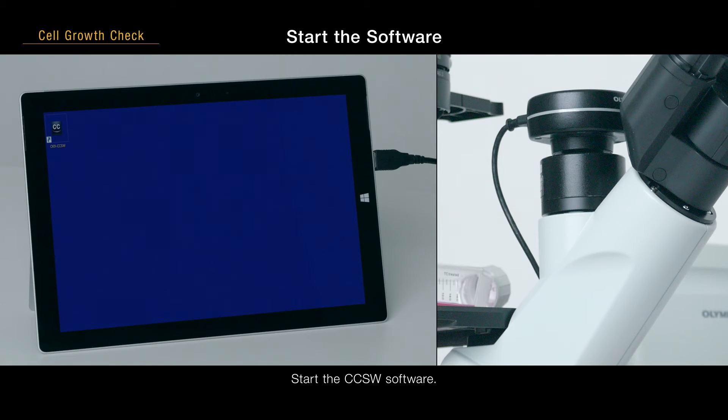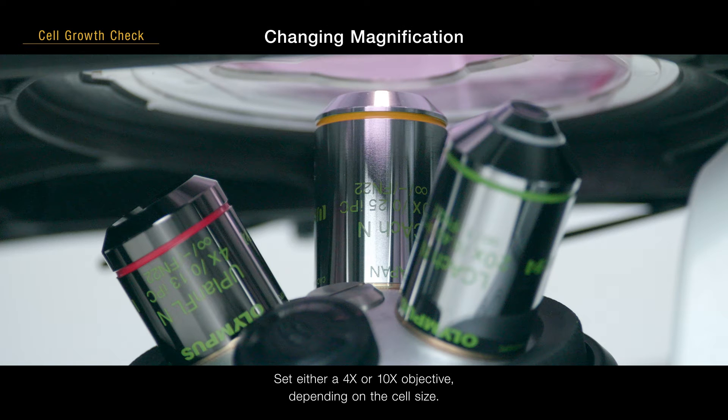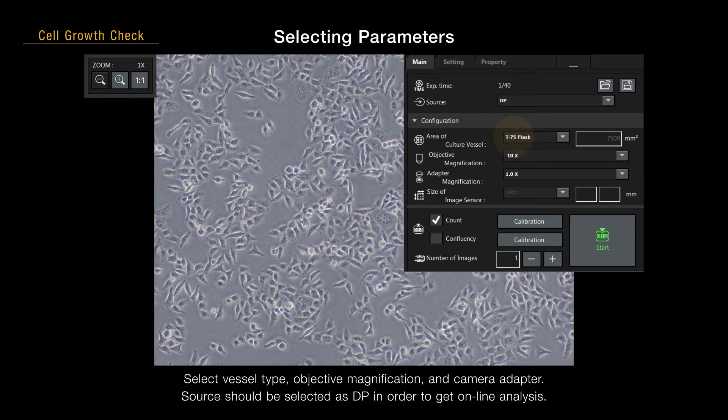Start the CCSW software. Set either a 4x or 10x objective, depending on the cell size. Select vessel type, objective magnification, and camera adapter.